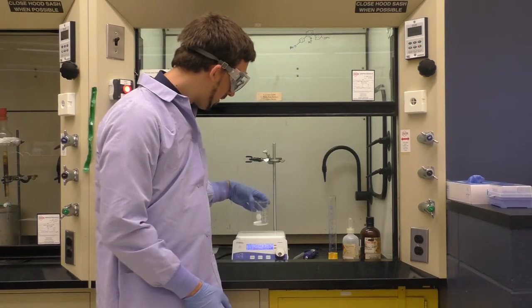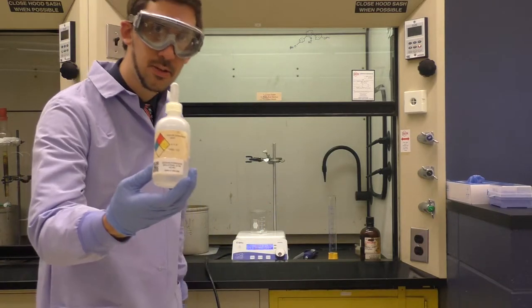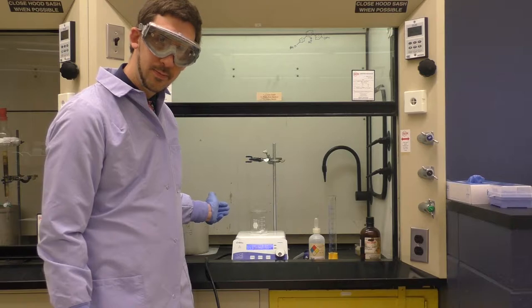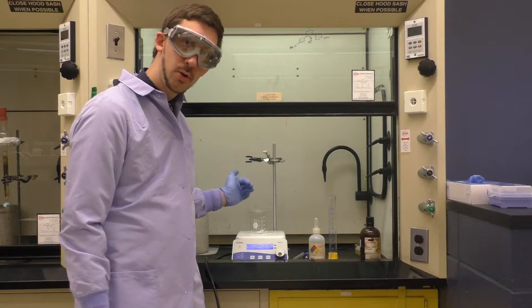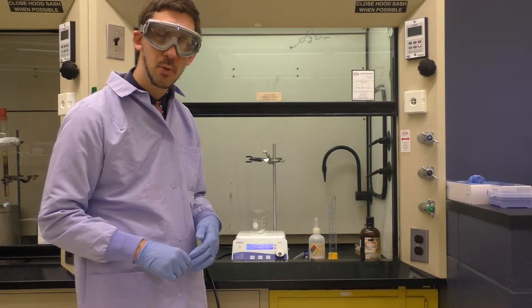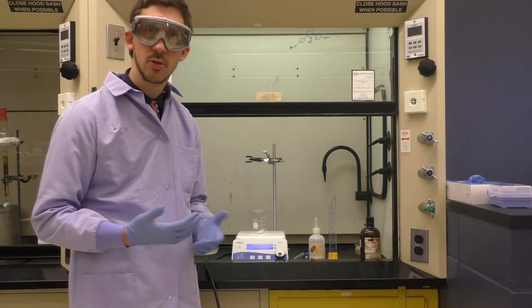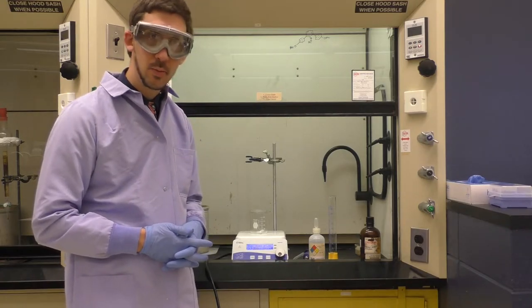After I've got that set on the stir plate, I will then measure out 40 milliliters of 6 molar sodium hydroxide, add that in, and then I want to bring the solution to a gentle boil. So I'll probably set the hot plate a little bit above 100 and have the temperature probe set into the solution. And then we'll bring this to a gentle boil and then boil the mixture for approximately 15 minutes. After that point, we can cool the solution and neutralize it using 9 molar sulfuric acid. So let's go ahead and get started with the setup.